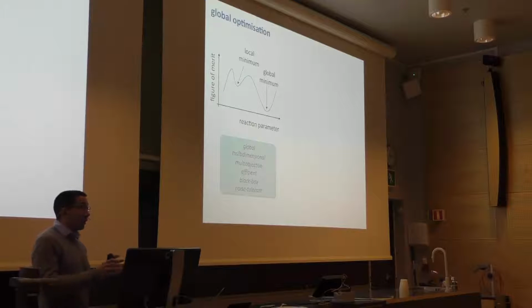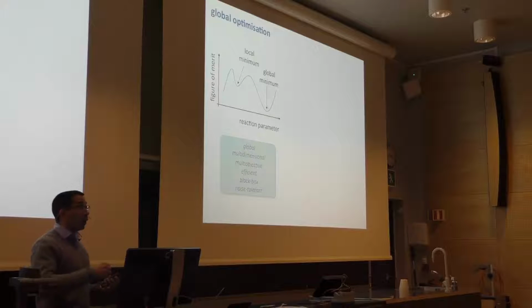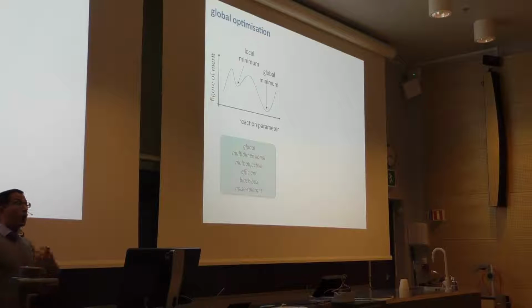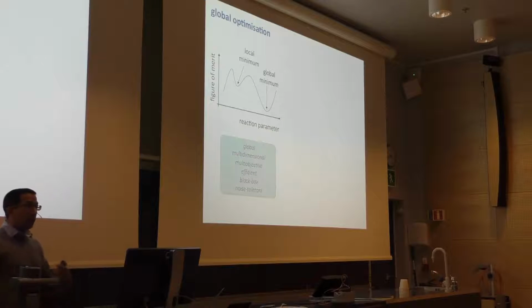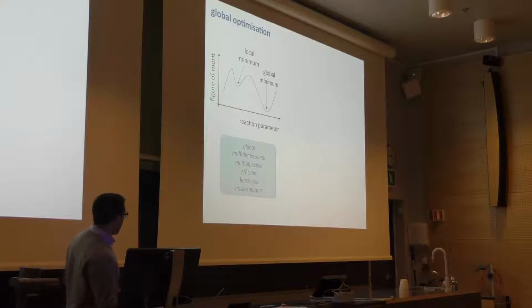So for example, if the model says there's an optimum to be found in this location, the algorithm will request the reactor to carry out a reaction at those conditions in the hope that the real experimental system will behave in the same way. So it's constantly carrying out more measurements to improve its model, and hopefully in the process of doing that, it's homing in on the target outcome.